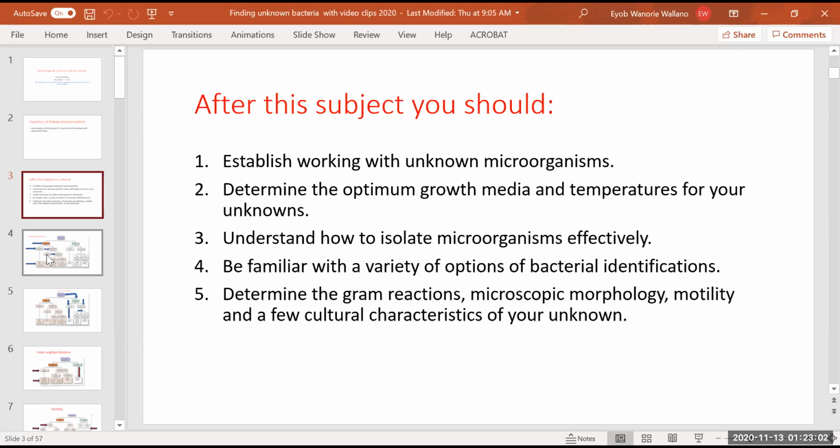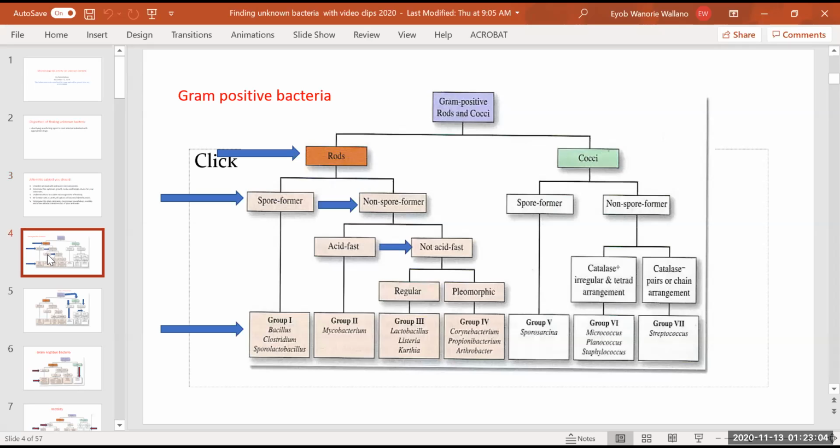Look now. For example, this one, Bergey's manual. It is identifying microorganism. You have it in your lab manual, I think page 115, 116. Okay, now. So you can find it in Google around, anywhere else. If you find it, Bergey's manual bacterial classification, it's good enough, really. So look at here. I'm going to help you to understand this principle, how to find unknown bacteria. Look, very interesting. Many of them you have done it already. I'm going to support by somehow.